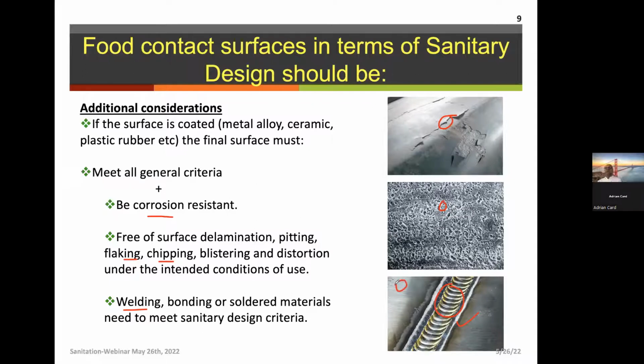What I typically see in many instances is that these differences are not being introduced into the swabbing protocol, and you see a lot of variation in these measurements. If you're using ATP or microbiological testing for pass-fail scenarios, just by swabbing the wrong area or by having the wrong characteristics of the materials, you might never be able to comply with those pass-fail requirements, okay? I'm going to get into more detail as we move forward in the presentation.